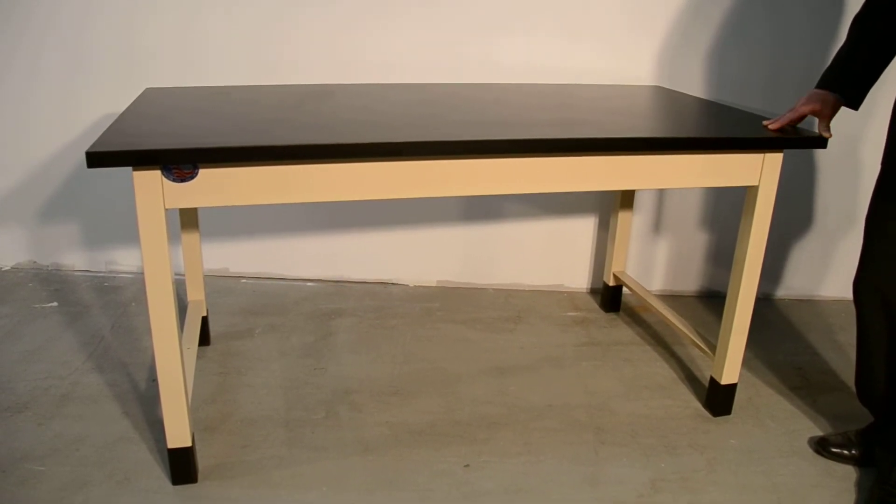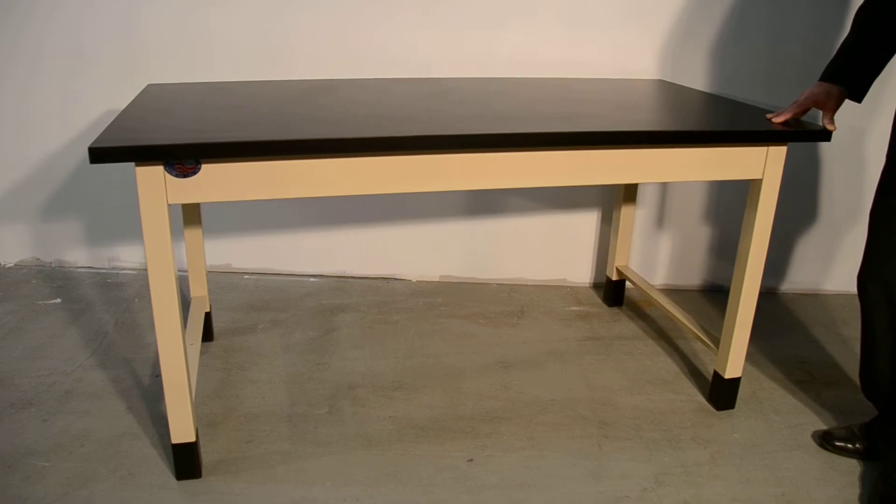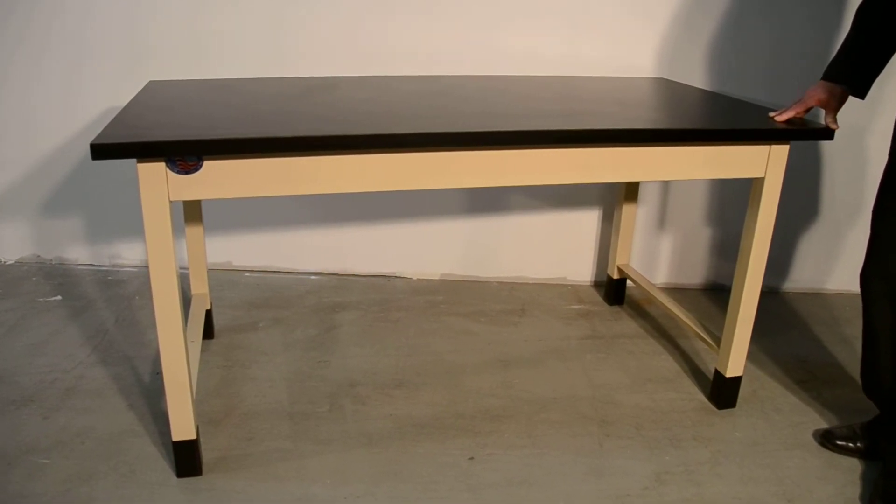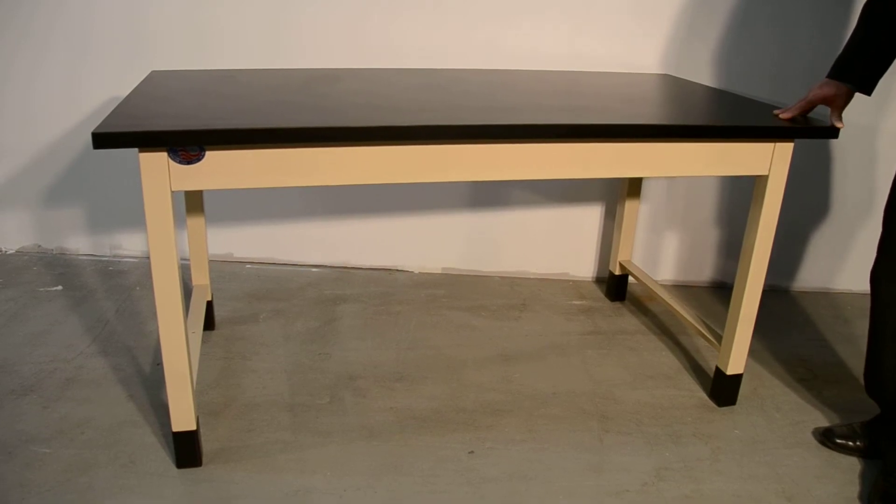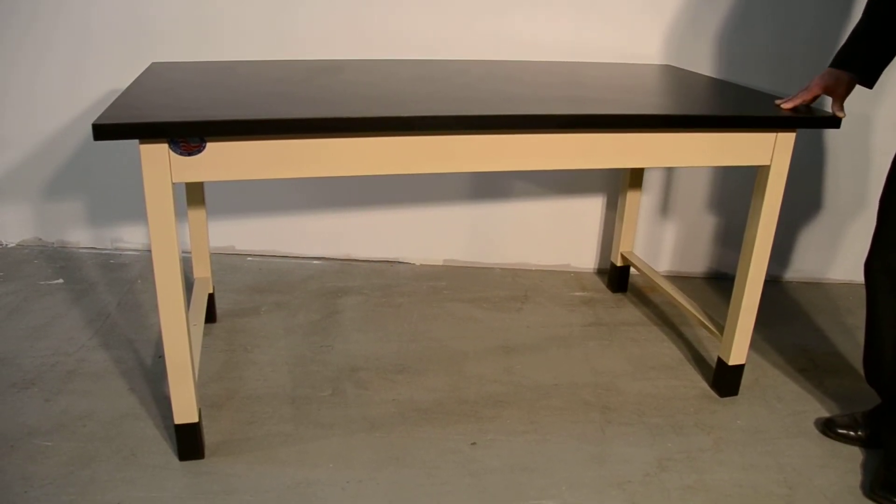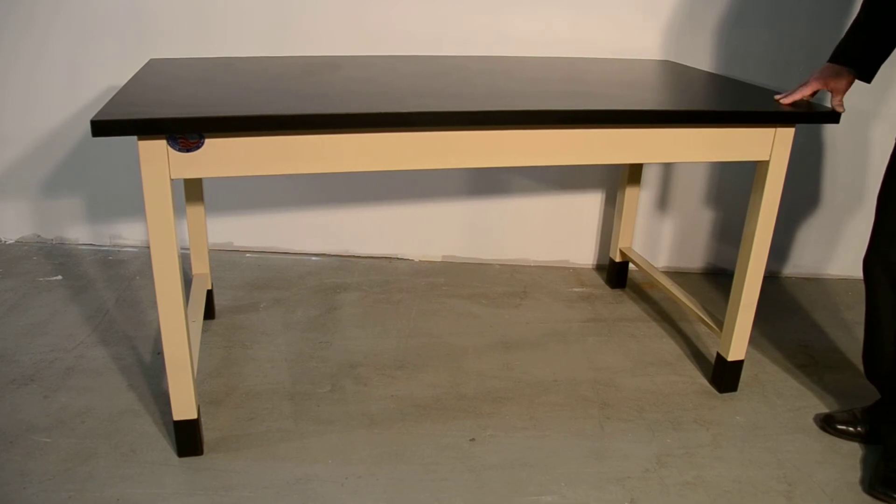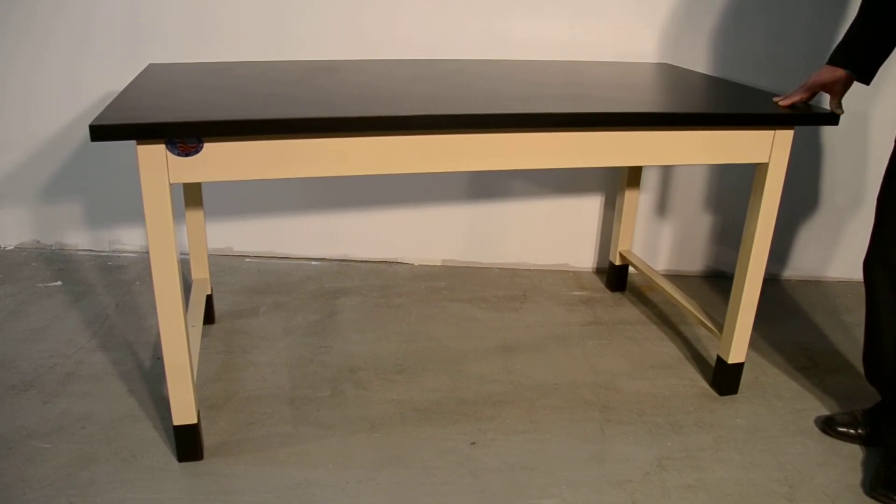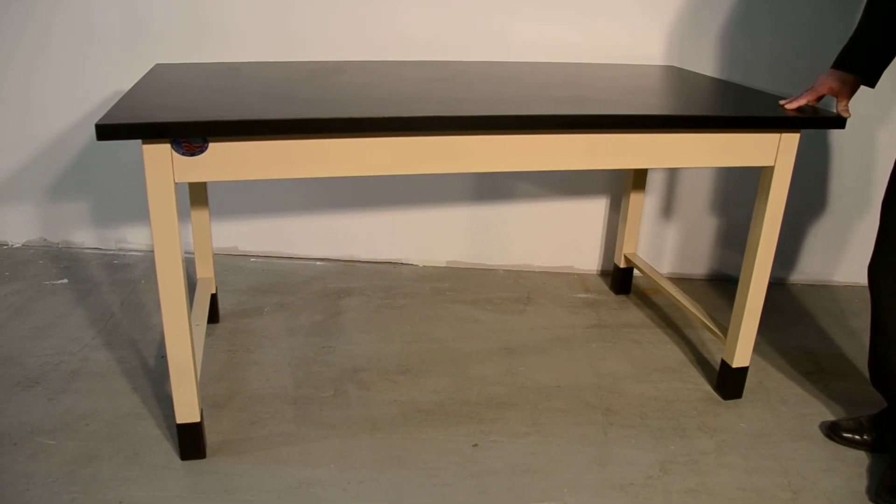If you're looking for an inexpensive, heavy-duty, strong workbench for your laboratories, this would be the model that you'd want to go for. The other thing that's nice about it is it's already drilled for ProLine's accessory upright supports, so if you needed to add overhead lighting, wire shelving, or storage cabinets, those will easily bolt onto this as well.